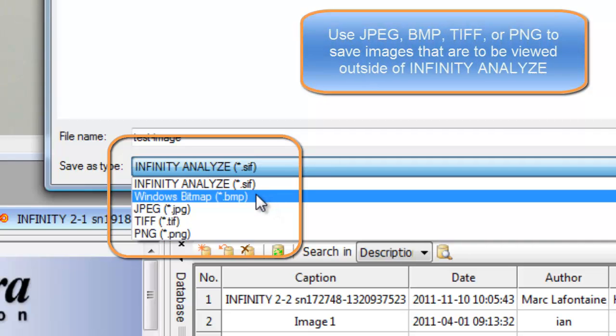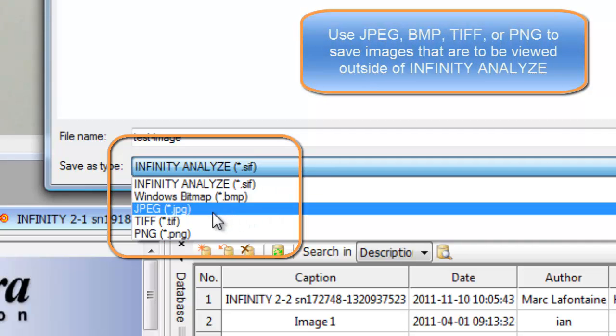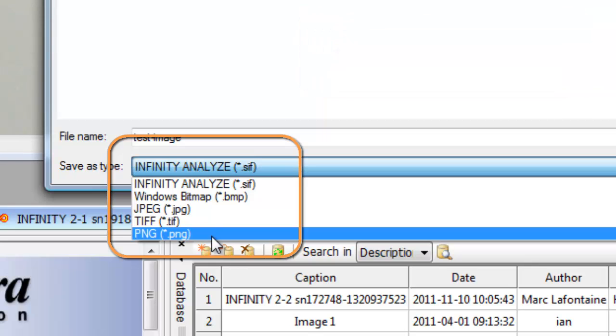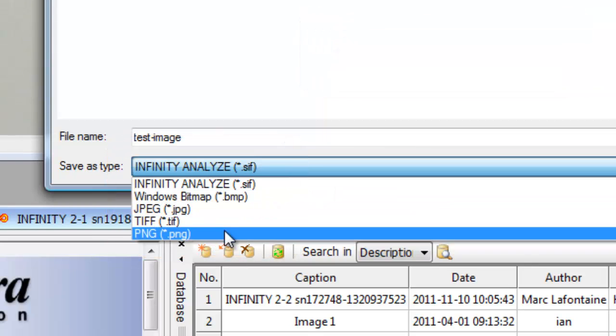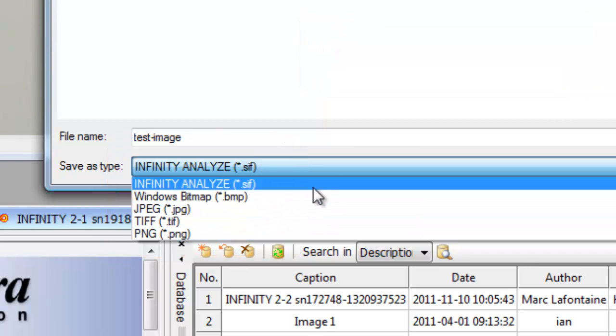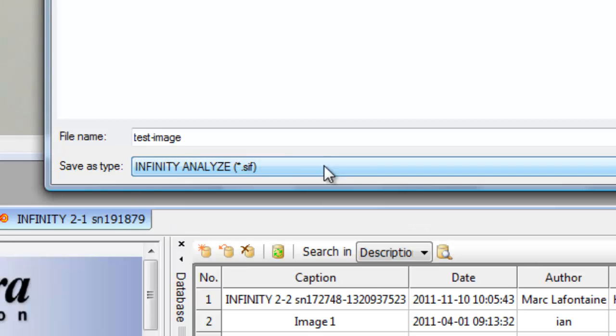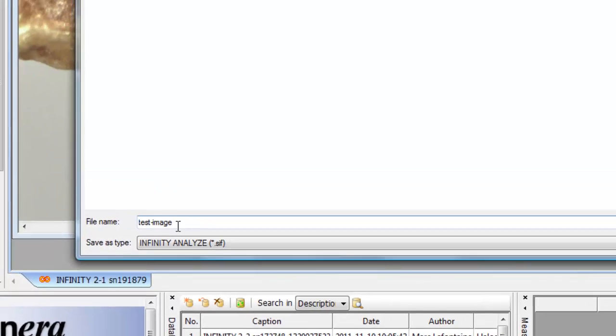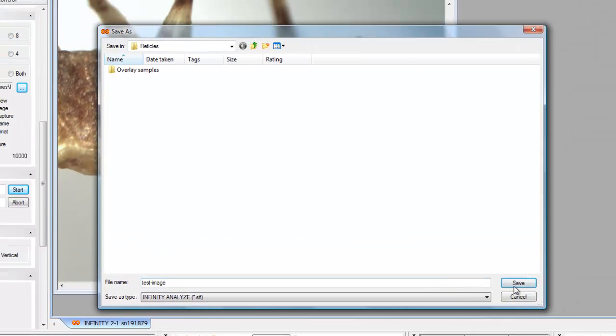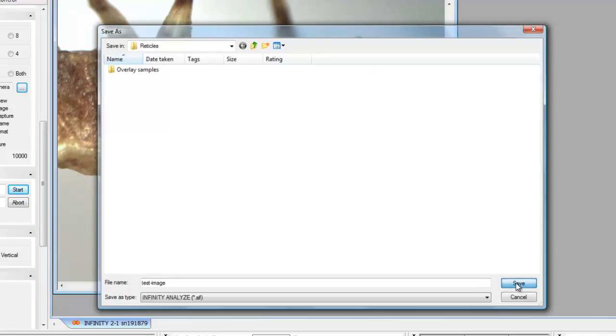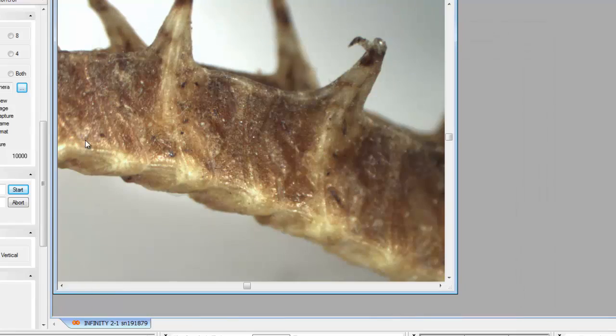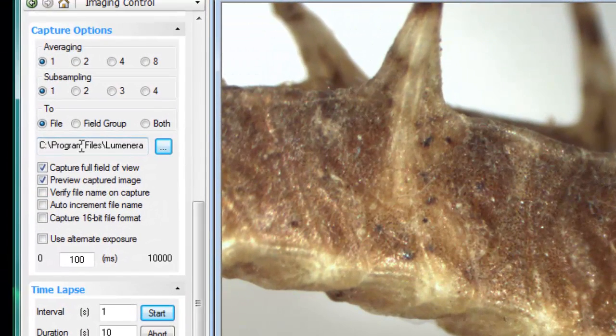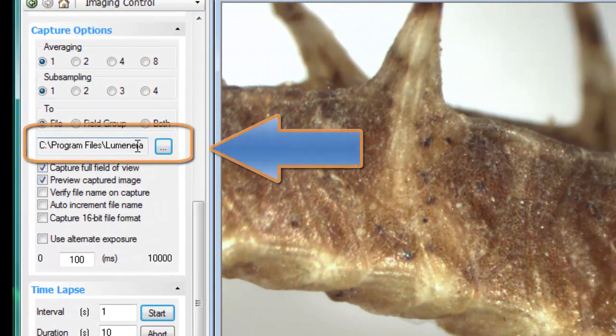If you want to share images with anybody else who's not using Infinity Analyze, then it's important to save images in a bitmap, JPEG, TIFF, or Portable Network Graphics format. You can select whichever of these file formats that you like, and images that will be saved will use this prefix or this file name. That file name path shows up here in the dialog.